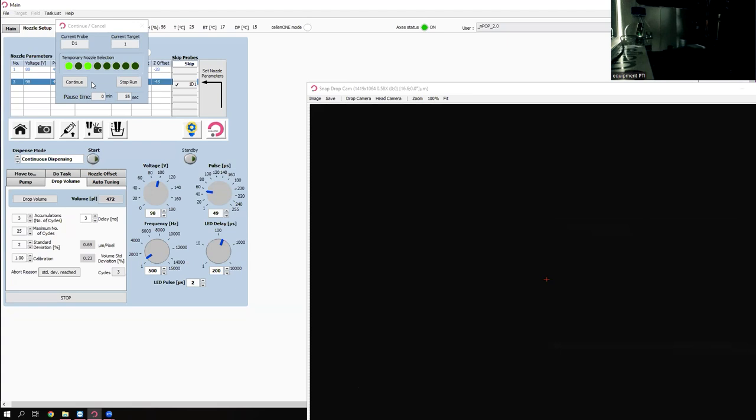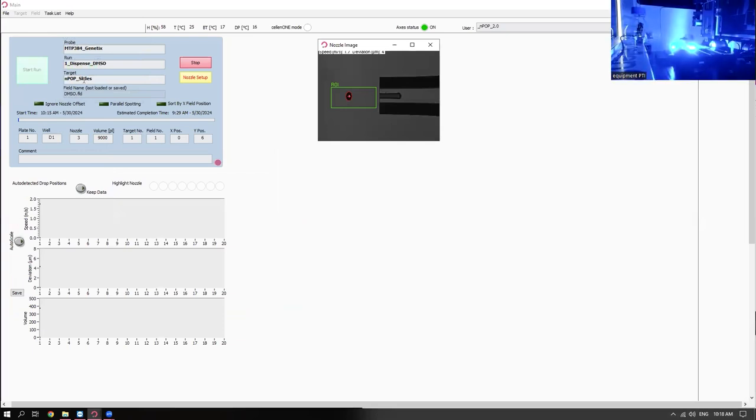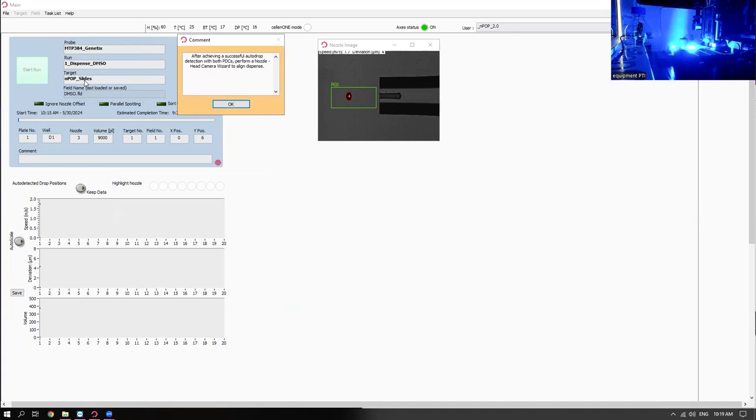For the labels, you'll want to use an anhydrous DMSO, at least with the TMT especially. So now we've got a good drop. We press continue. It's going to do an auto drop detection, which gets us some information about the drop volume and the dispensing stability.